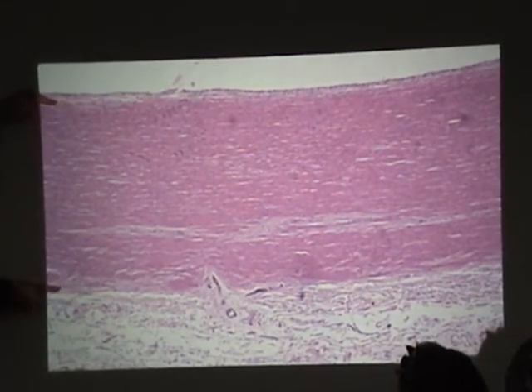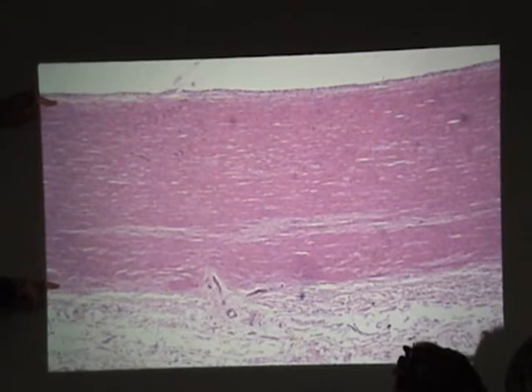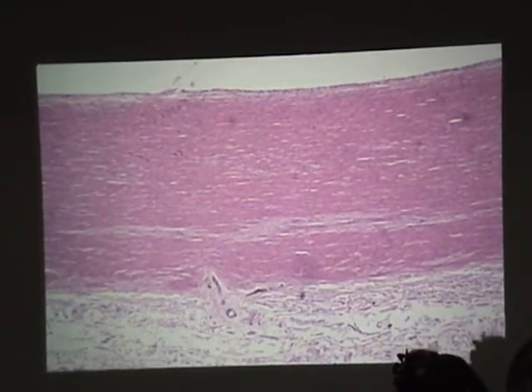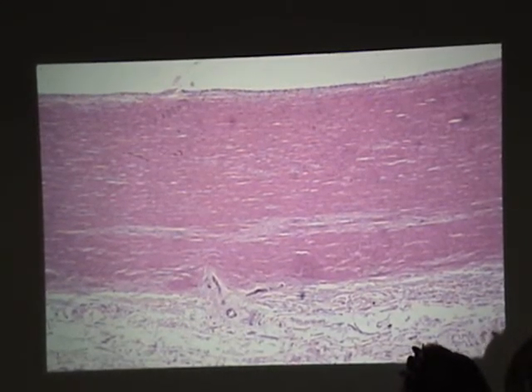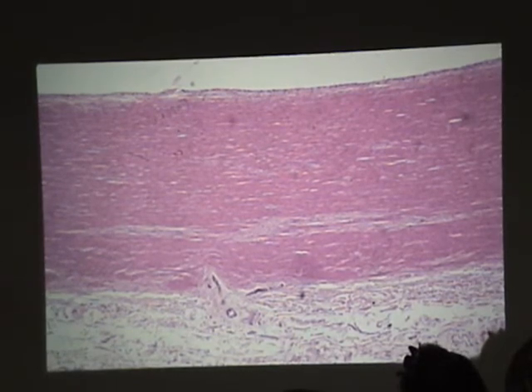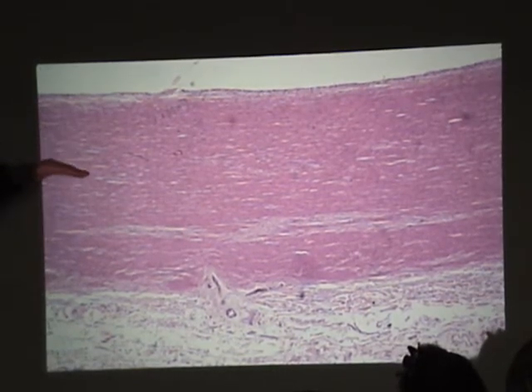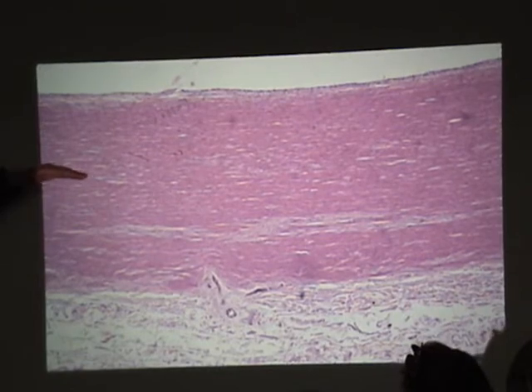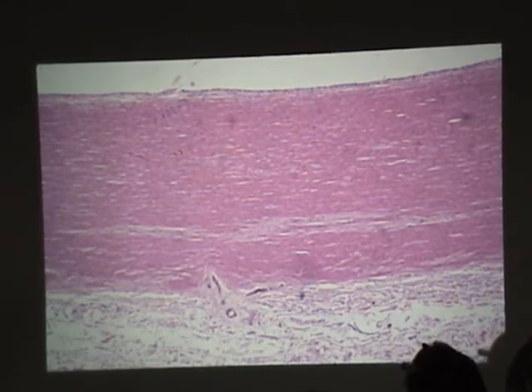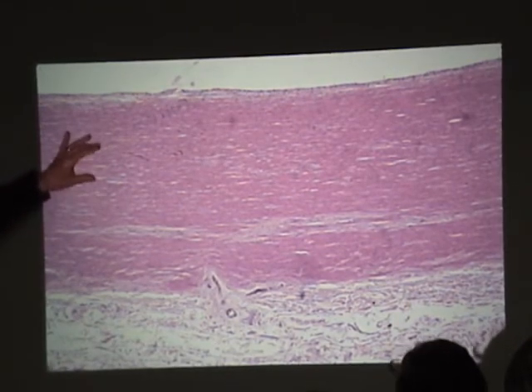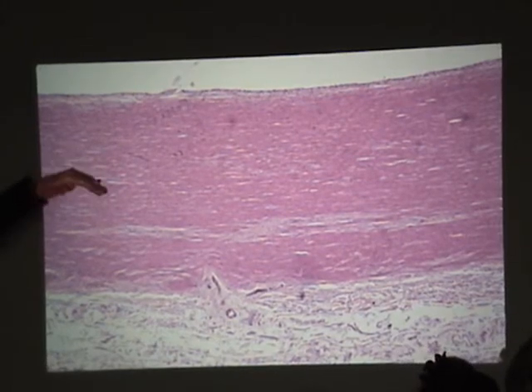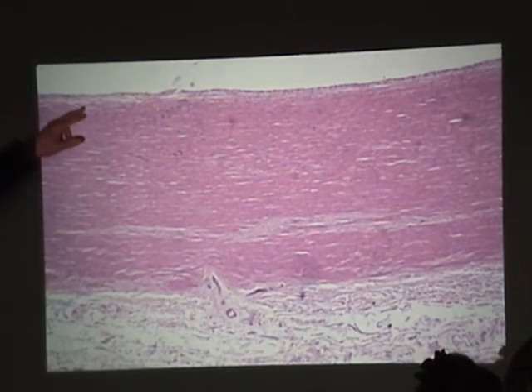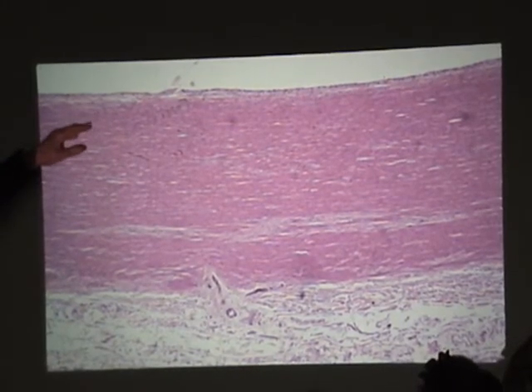From here to here is the tunica media, made up mostly of elastic lamellae — layers of elastic sheets of elastic tissue. They have holes in them so that smooth muscle cells in adjacent layers can communicate, and also so the endothelial cells can communicate.